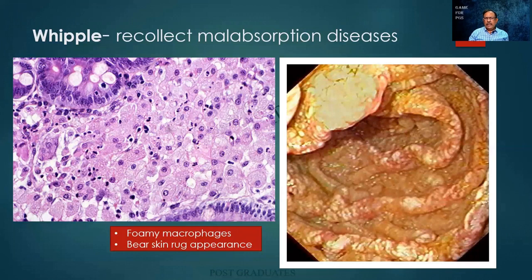I had been mentioning earlier, it is a temple of surprises. The question for you can be malabsorption syndromes. Generally, we find it very difficult. It is given extremely well in your Robbins and other books, but reading it repeatedly is difficult. Hence, I have brought out some pictures for you.